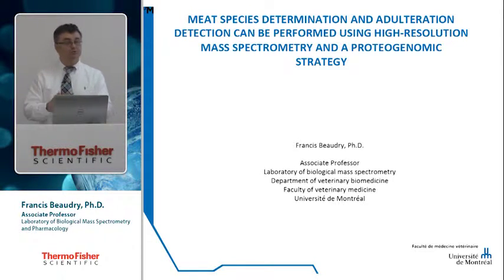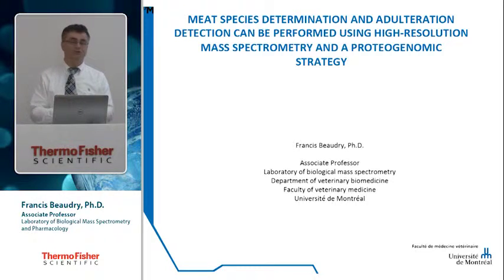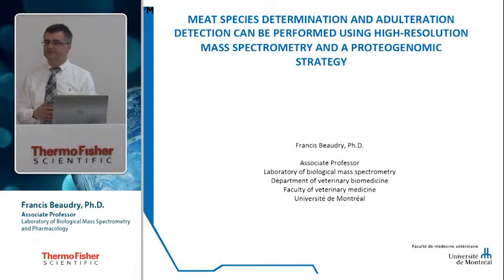We're very much into targeted proteomics instead of doing shotgun proteomics, and I will try to go with you through the workflow and try to convince you that the workflow we propose is a lot more compatible with routine analysis compared to what has been done in the past.